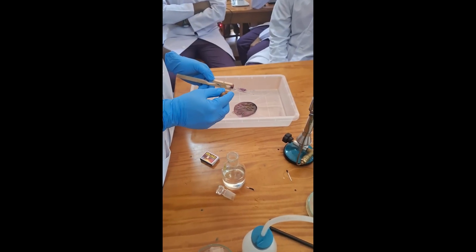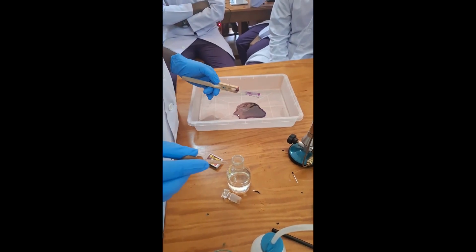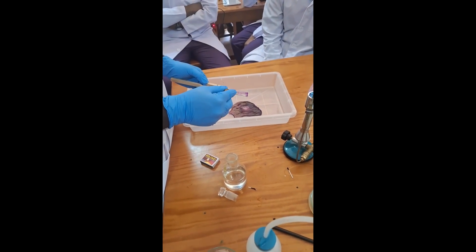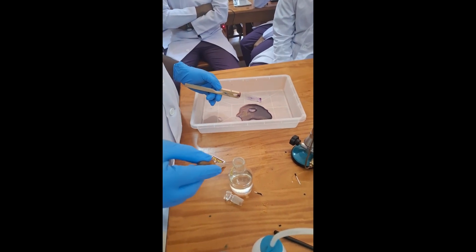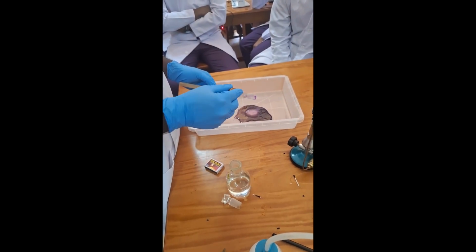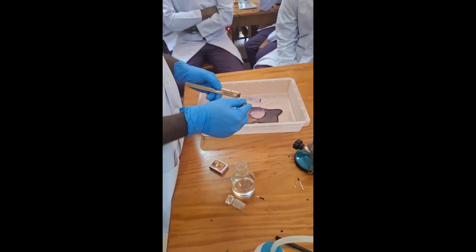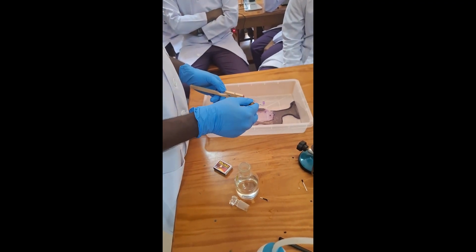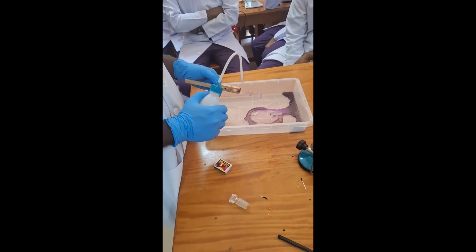Decolorize with 95% ethyl alcohol dropwise until runoff is clear. Ethyl alcohol dissolves the outer membrane of Gram-negative bacteria and washes out the crystal violet iodine complex, while Gram-positive bacteria remain purple due to their thick peptidoglycan layer, allowing clear differentiation between the two types. Rinse with tap water for 5 to 10 seconds.